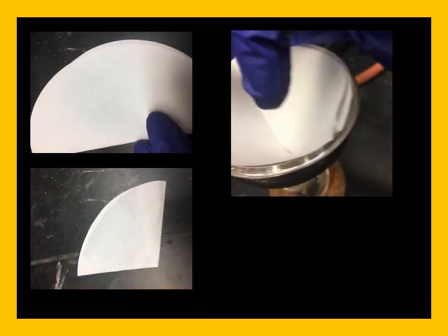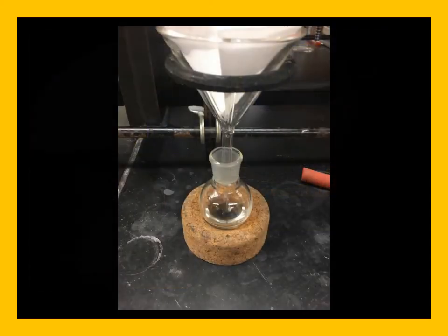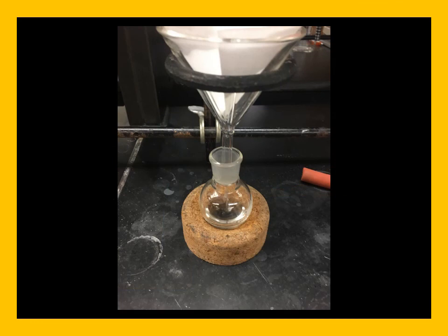Now I'm going to remove the drying agent. Now some people like to remove the drying agent by making fluted filter paper. I prefer to fold the filter paper into a quarter and now open it up in the ring. That's just less work for me than fluting it. And here you see my setup. I'm supporting and resting the round bottom flask on the cork ring, and I'm supporting the filter by this funnel, and this allows me to pour my solution in it.